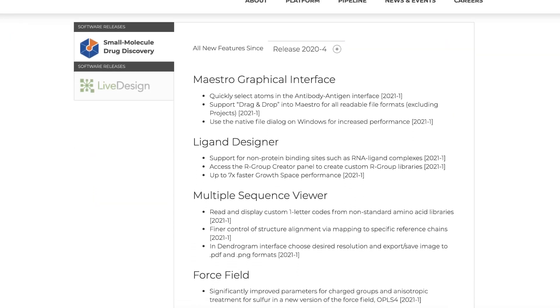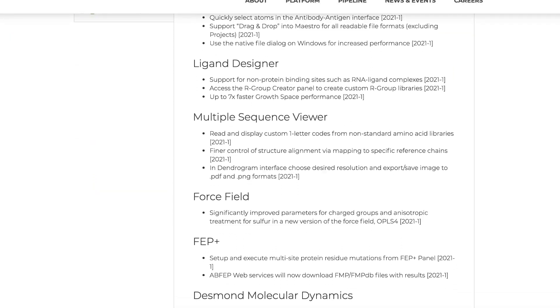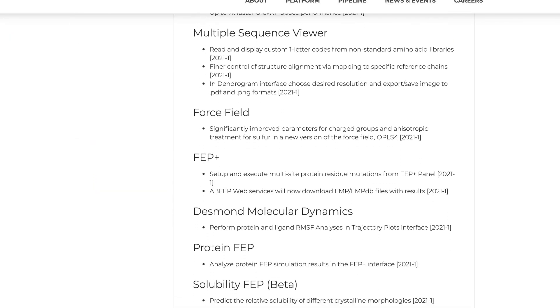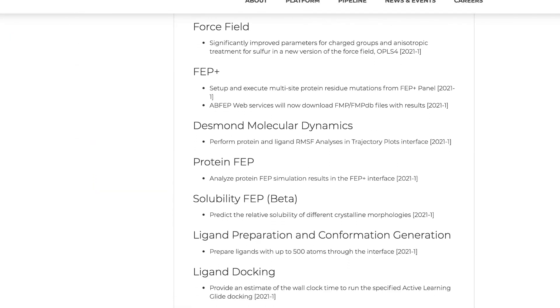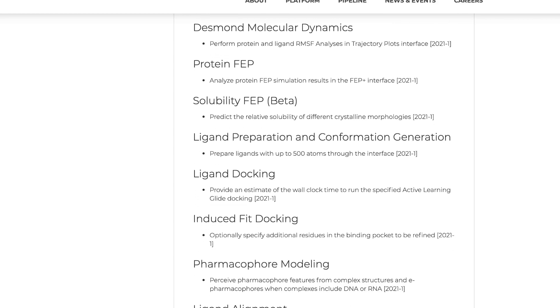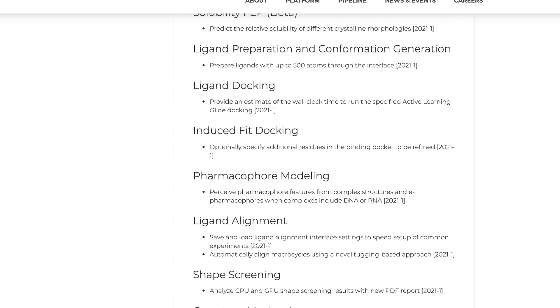Introducing the 2021-1 Schrodinger release. Let's take a look at some of the new features and enhancements.